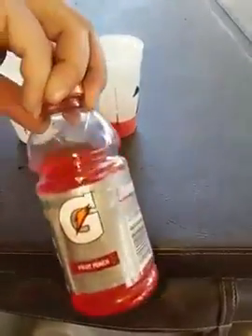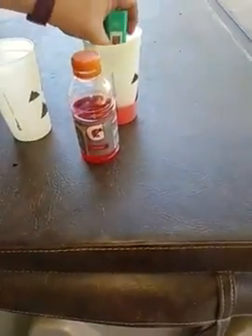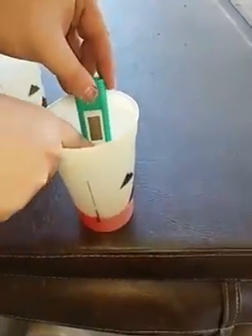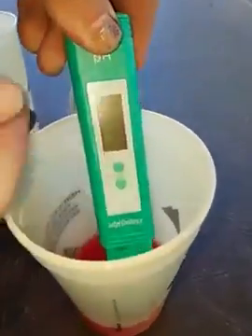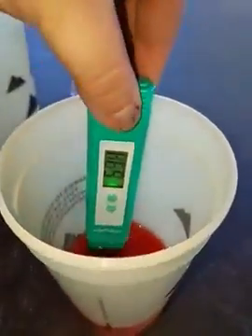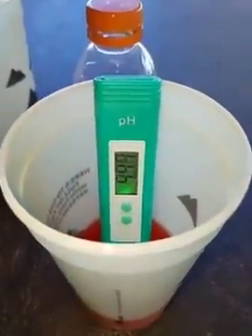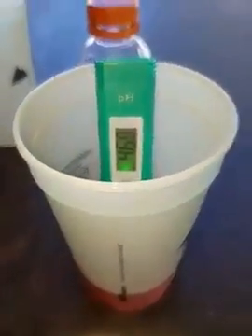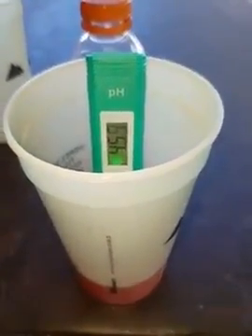As you can see, I have Fruit Punch Gatorade. It is already in the cup. So I'm going to go ahead and stick it in there. Come up closer, please, so you can see it. And then I'm going to hit the on button. I'm going to let it sit, because I'm going to let it stabilize. Usually it might take about 30 seconds or so.